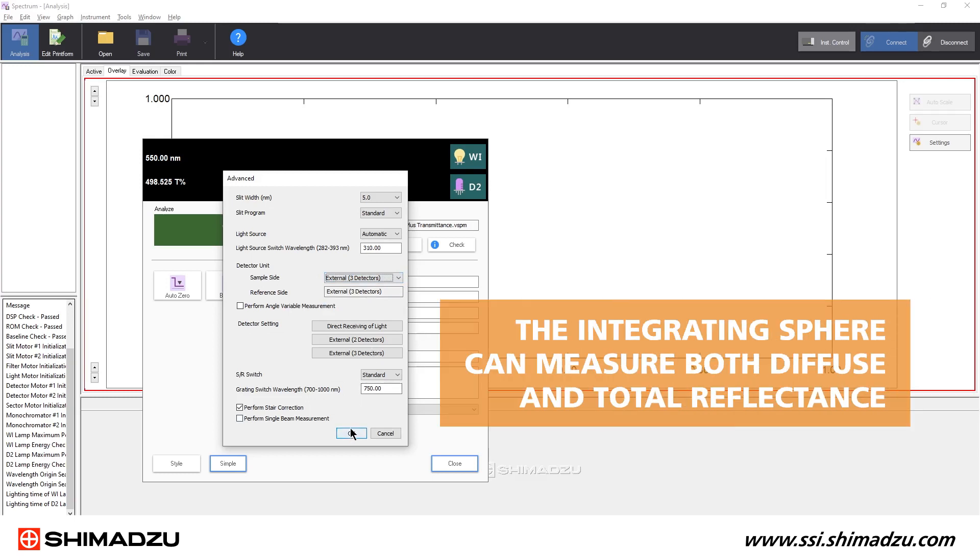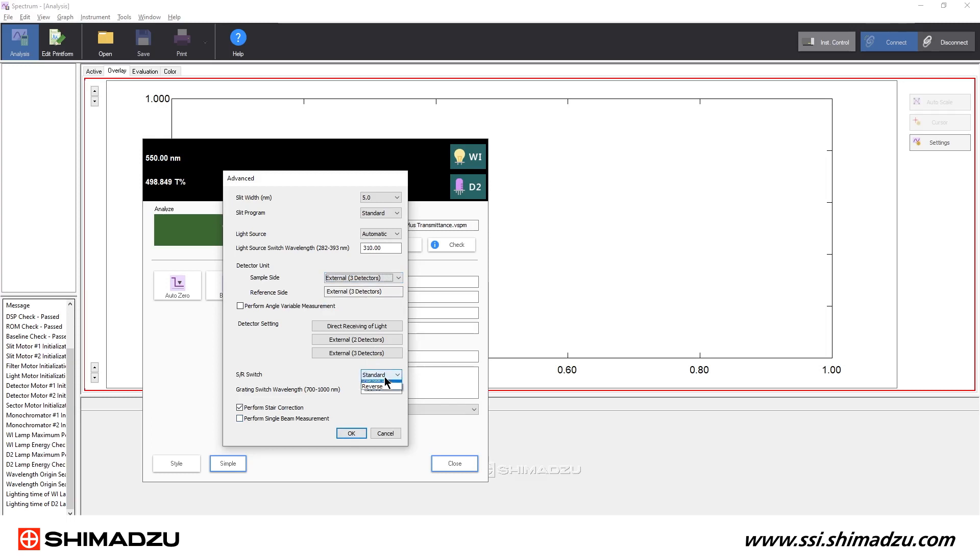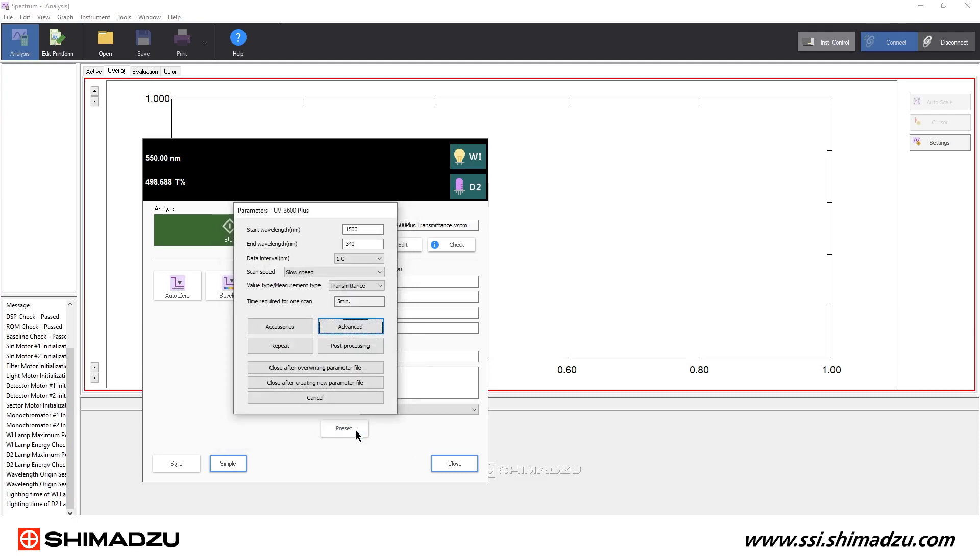The integrating sphere can measure both diffuse and total reflectance. For diffuse reflectance, make sure the SR switch is set to Standard. And for total reflectance, set the SR switch to Reverse.